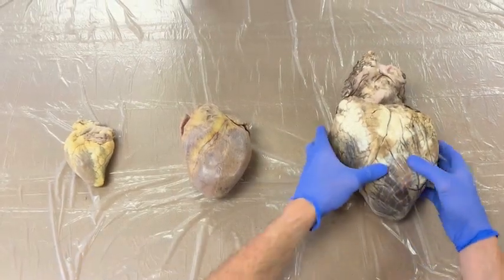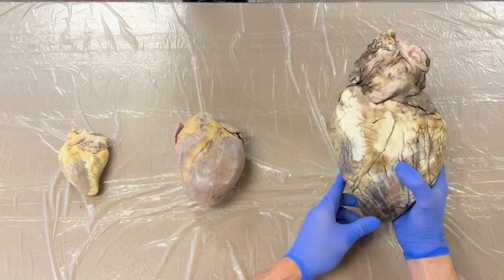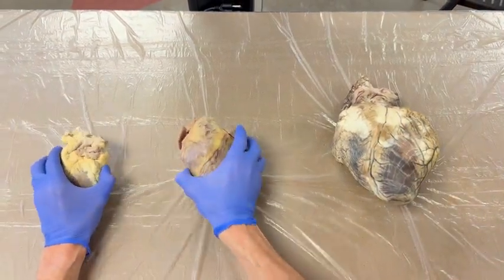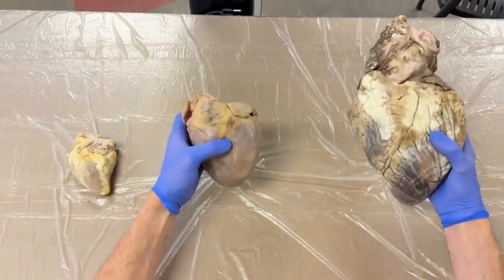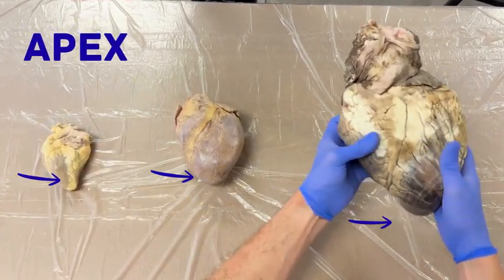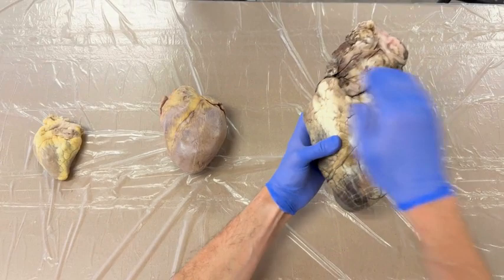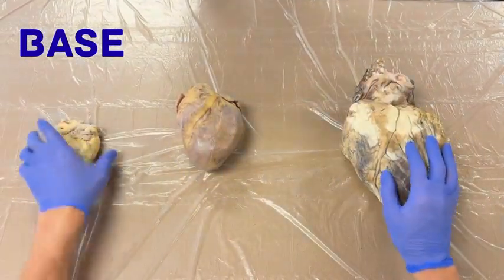So the first step when you're looking at these hearts is trying to identify the front, back, bottom, top, right, and left. You'll see that they have a lot of features in common. The main feature is that the heart has a pointy end, called the apex of the heart, and it points downward. At the top, the heart is flattened out. That's called the base of the heart, and it points up.